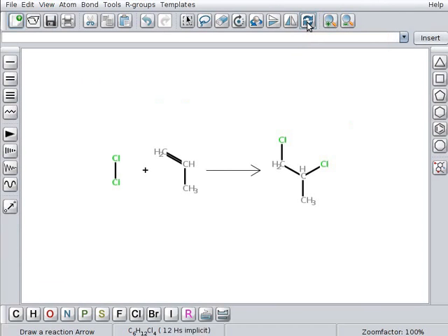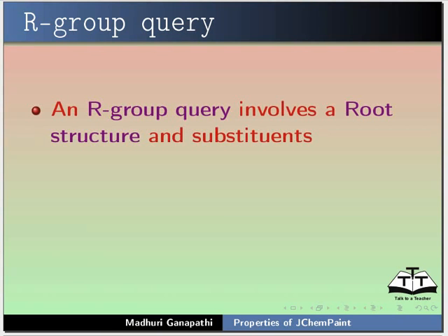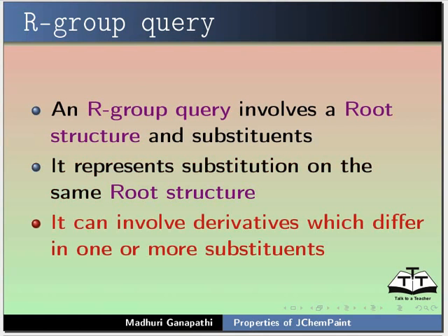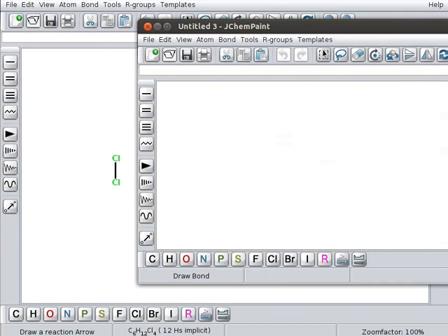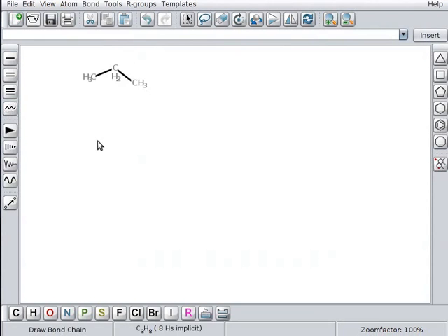I will now discuss about how to set up an R group query. What is an R group query? An R group query involves root structure and substituents. It represents substitution on the same root structure. It can involve derivatives which differ in one or more substituents. Click on create a new file icon to open a new window. Click on draw a chain button. Click on the panel to draw a carbon chain with 3 carbon atoms. Let us create a substituent that has to be attached to the carbon chain. For example, benzene.